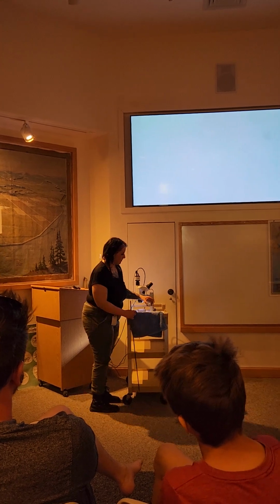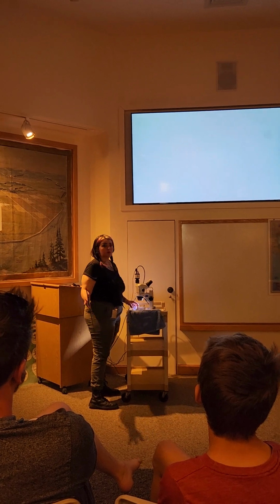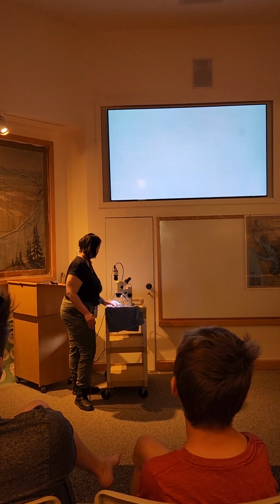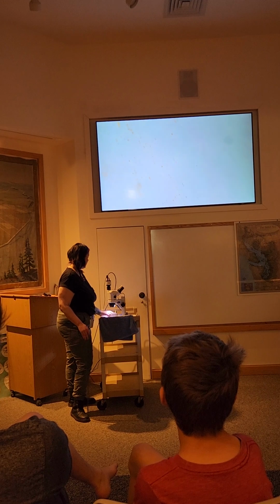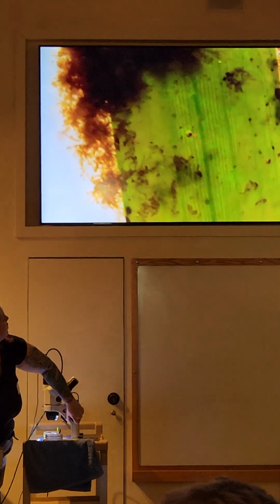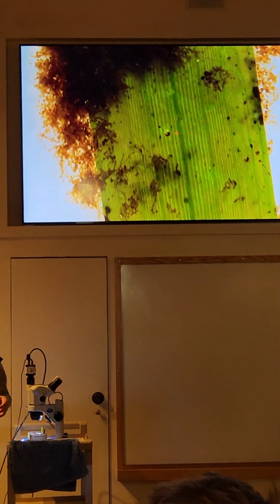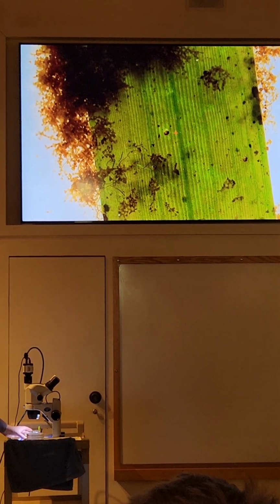For the most part, they're going to hang out near the surface of the water, because that is where most of the productivity happens. This is also some phytoplankton, but this is when they form chains all together. So this is what we call epiphytes. They're an accumulation of plankton on the eelgrass. And when you see it on the beach, it just looks like a bunch of fuzz.